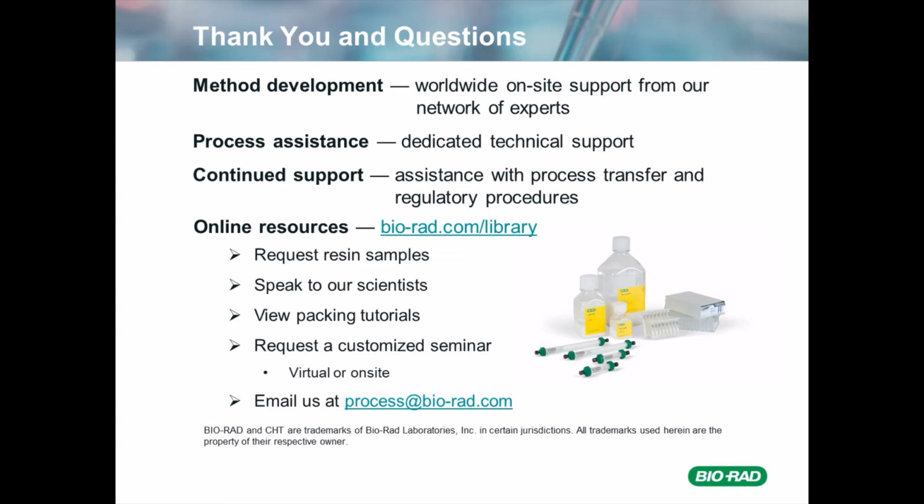Okay. And do you consider agarose-based media compressible or incompressible? Well, agarose-based media is definitely compressible. And do you need to do anything differently when packing incompressible resins in stainless steel columns? So that's a great question, and the answer is yes.